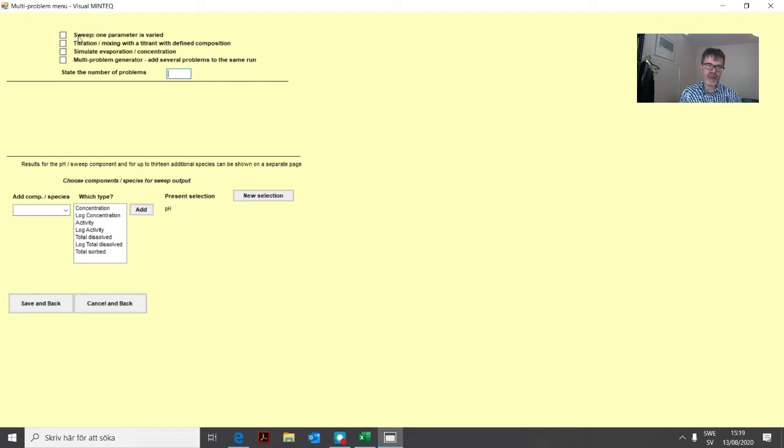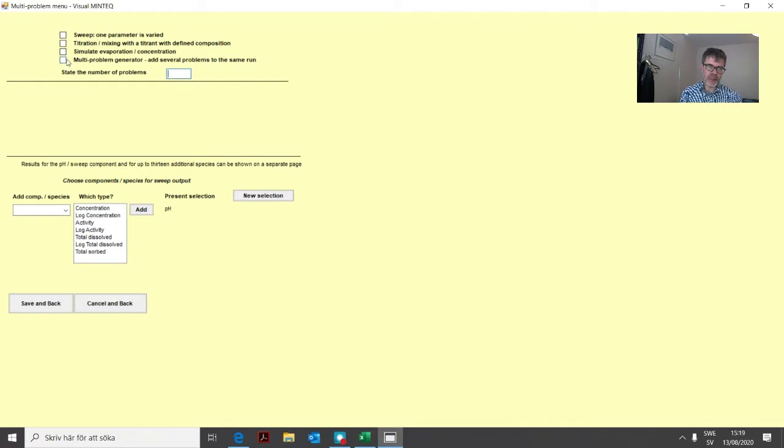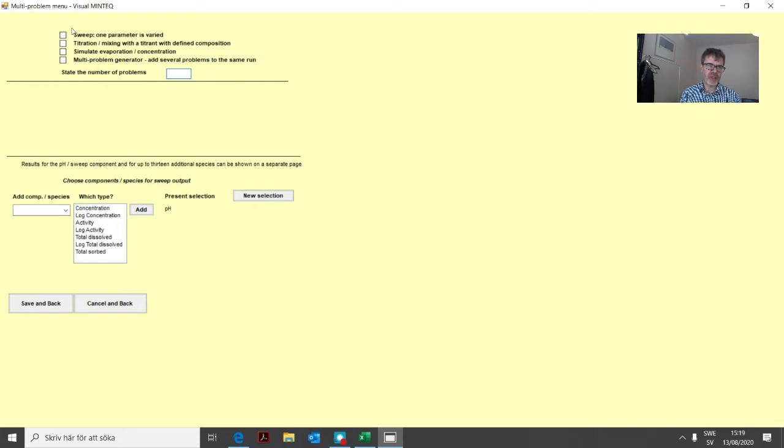We have the sweep option which we will be looking at soon. Another part here is the multi-problem generator. These are the two ones that we will focus on.